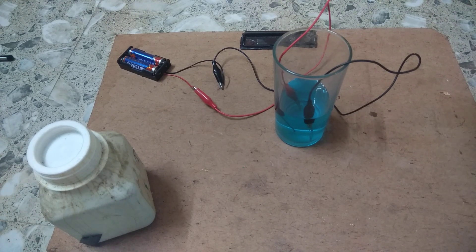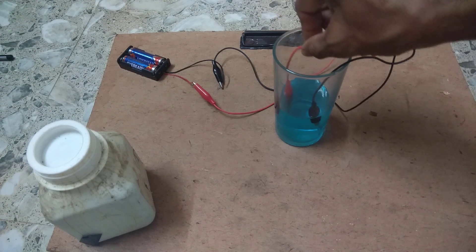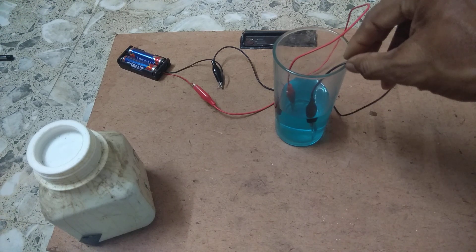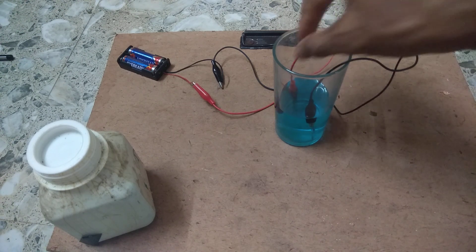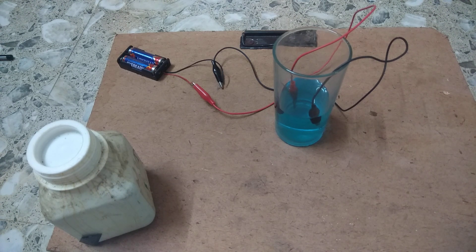We are trying to electroplate copper onto the cathode. The positive terminal is the anode and the negative terminal we have connected is the cathode. Let's see what happens to them in the copper sulphate solution. We have to wait for some time to see the reactions.